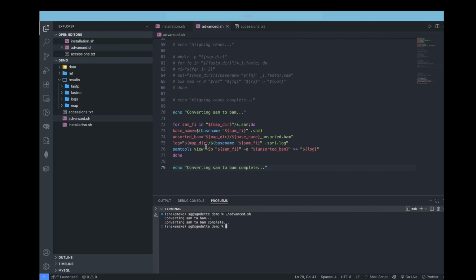Why are these two important? Now, the reads in your BAM files are in the order in which the sequencing platform gave it to you. But when we want to do the variant calls as well as when we do the visualizations, we basically want to maintain the order that the reads exist in within the genome. And that is why we need to sort the files. Now, we need to index the files to enable us to easily and randomly access the BAM files without needing to read the entire file.